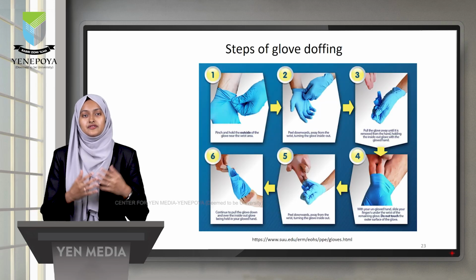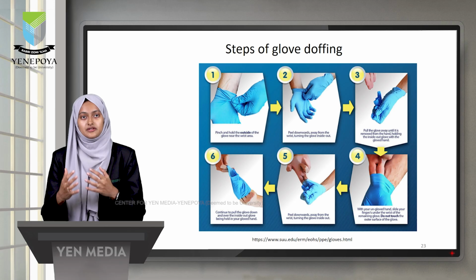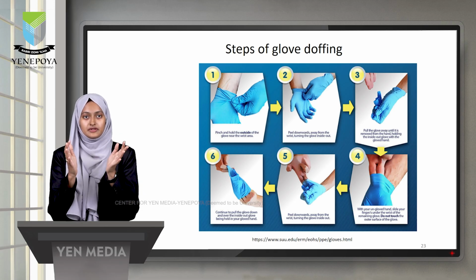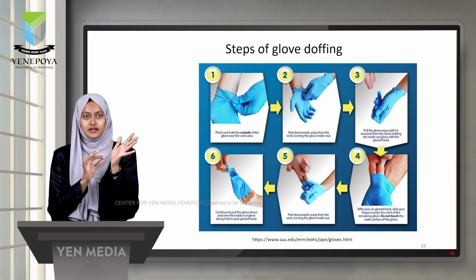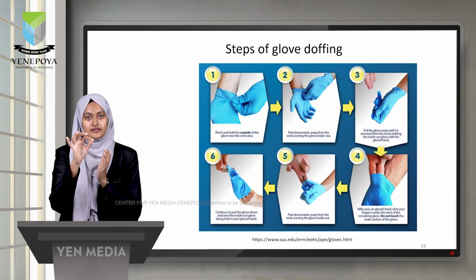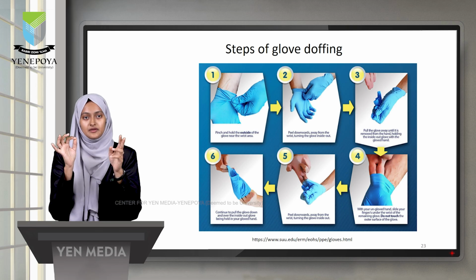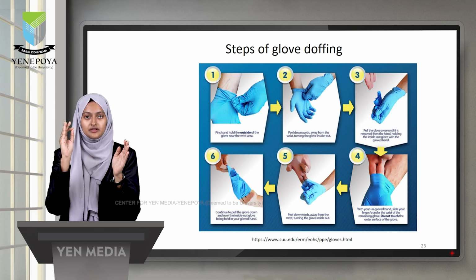Now, after the procedure, how is the glove doffed, that is, removed? You have gloves on both hands. With the first hand, you pinch the edge of the glove near the wrist, and you do not touch the inside of the glove, just the outside, and pull it off like this. So in this way you have the removed glove in the gloved hand. You have the bare hand here, you have the glove here, right?